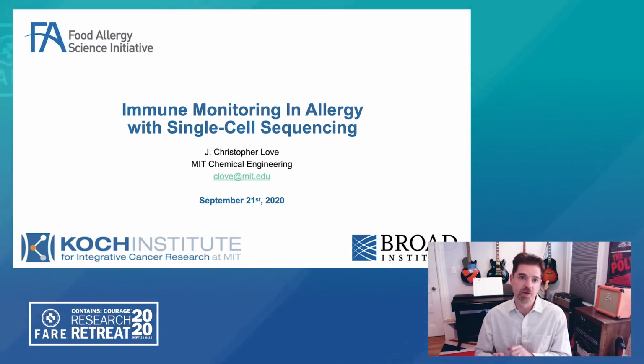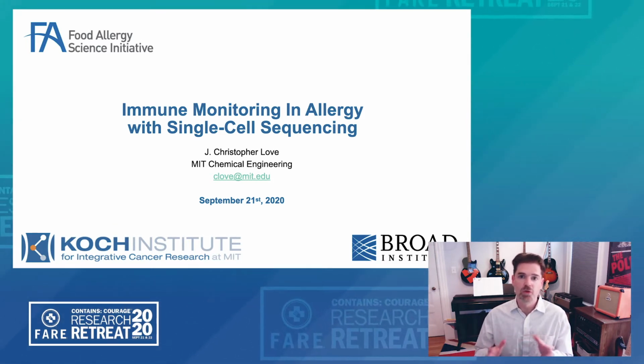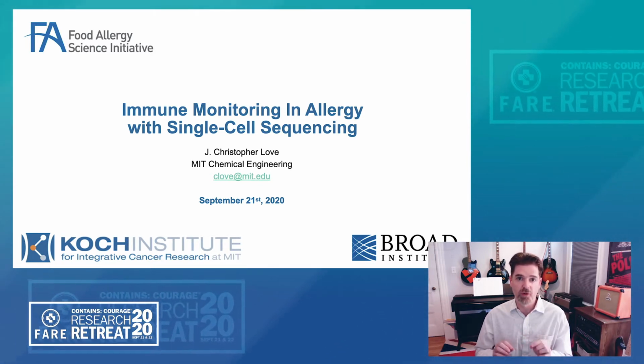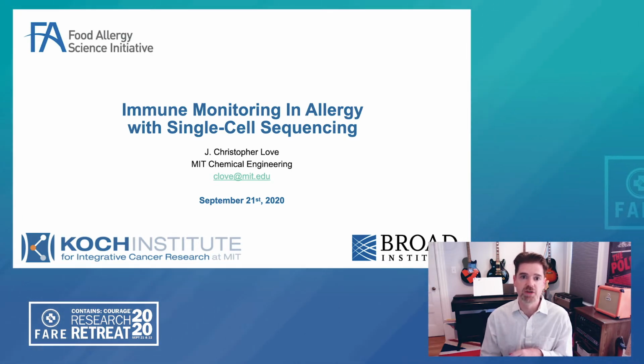in the context of an intervention like oral immunotherapy, or in the natural progression or state of a disease like eosinophilic esophagitis. So we're going to look at two different strategies and how we can use single-cell sequencing to inform characteristics of the cells that are manifest in both of these two conditions, oral immunotherapy and EOE.